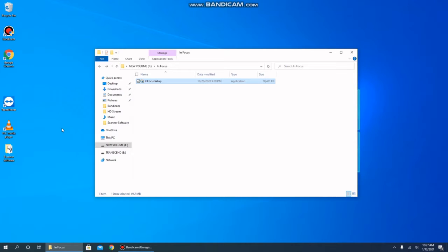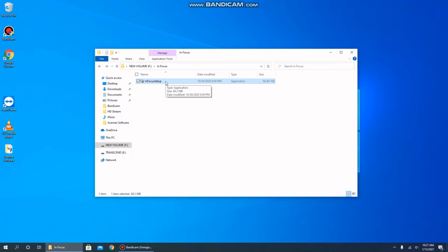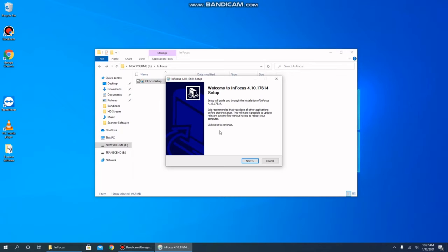When you're ready to go, please insert the USB stick or CD drive in your computer and locate the application called InFocus Setup. Please note you will need administrator privileges on the computer to fully install the software. Double-clicking the icon will launch the installer.